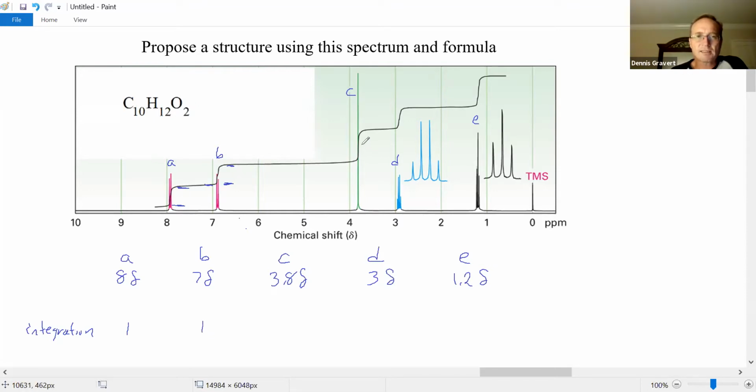And this, what do you think? Is that quite 2? I don't think so. This looks like 2. That looks like 1.5 to me. And this one, that looks like 1. It's definitely smaller than this height, right? This height is bigger than that height. And that height looks like the same as these two. So I think that integrates to 1. And this looks like twice. Well, it might also be 1.5. Let's also say it's 1.5.